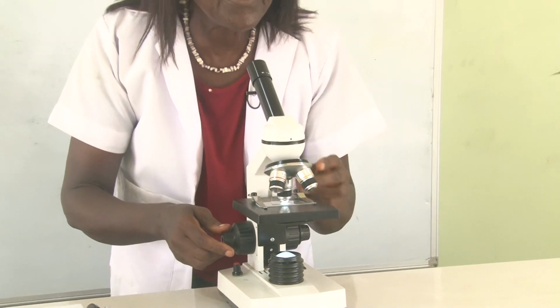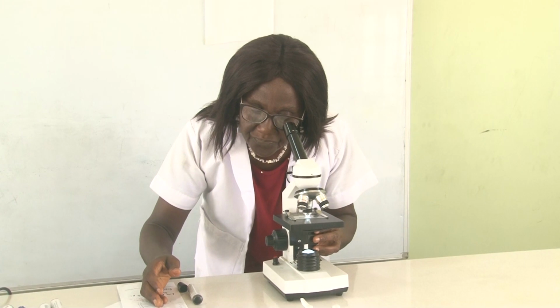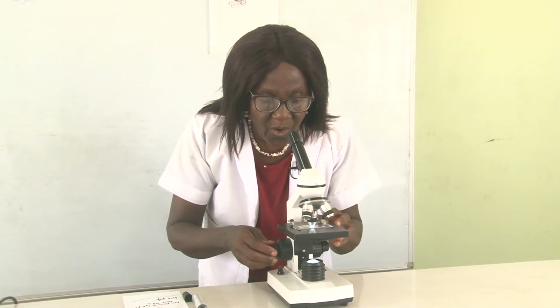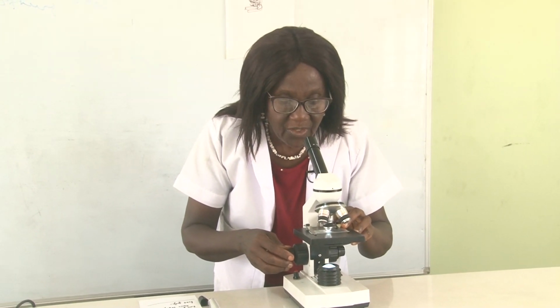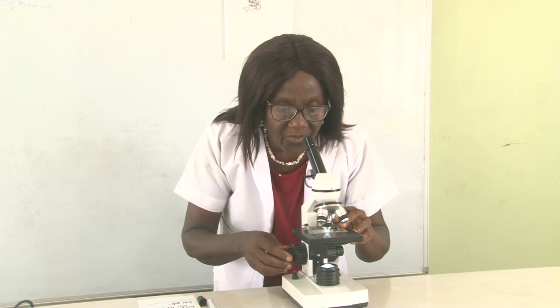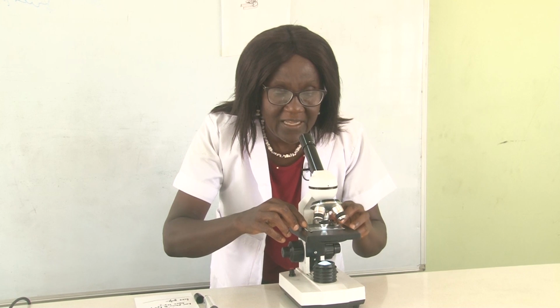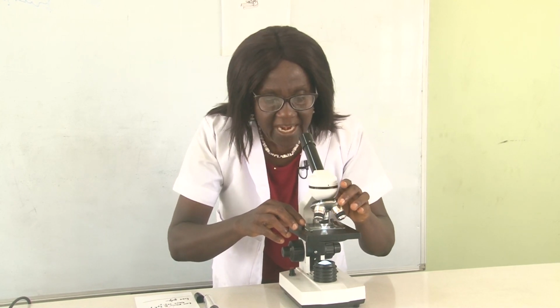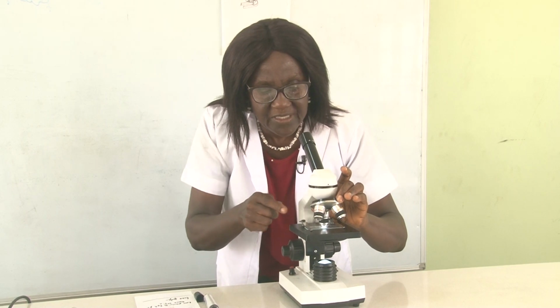Now, after you've seen your specimen and drawn your specimen, you've finished the work, and you want to take the slide off. Don't remove the slide while the high power objective lens is on. Turn from the high power objective to the low power objective using the revolving nose piece.